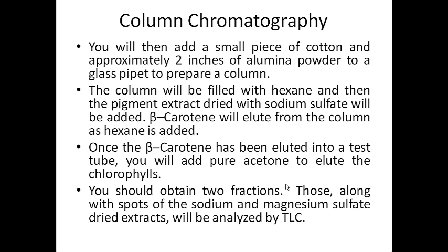Okay. At the end of the experiment, you're going to put all of your solutions in the waste container. You can put the disposable test tubes and the pipettes all in the glass waste container. You will take digital pictures of the plates so that you have pictures of those to be able to answer questions about them in your report form. And outside of that, that's our introduction to TLC and column chromatography.